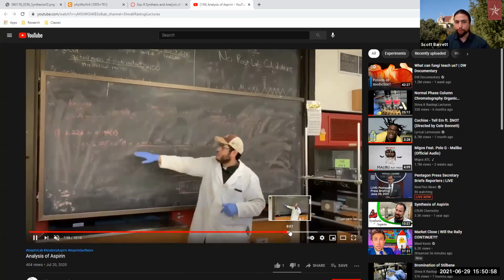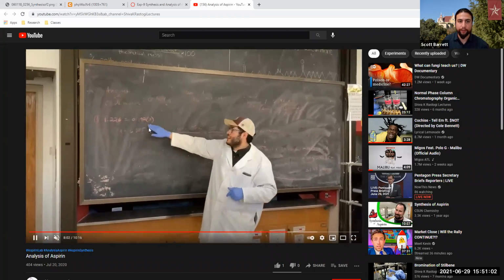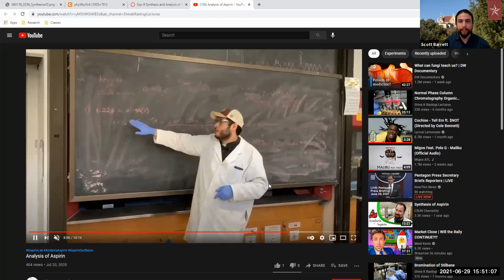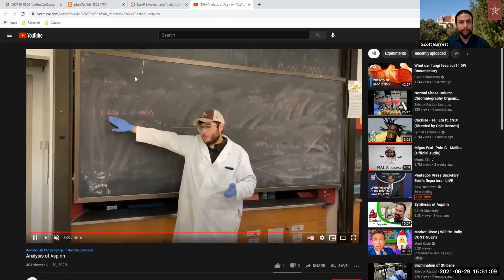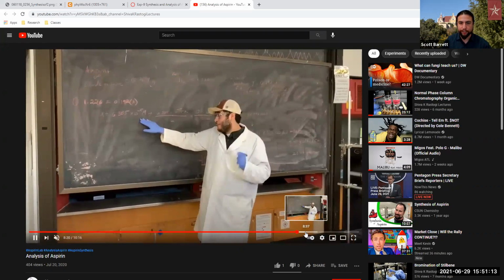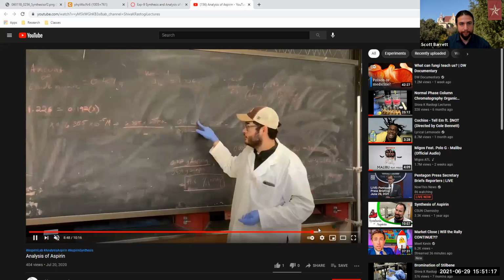And I recommend to watch through this portion as well. I recommend to watch both so that you have a good understanding of the full synthesis and analysis. But this will be the primary method that you're going to perform your back calculations in order to obtain your quantity.